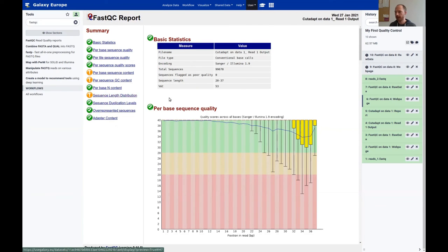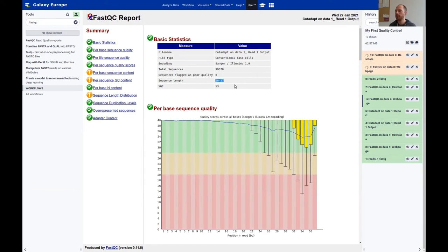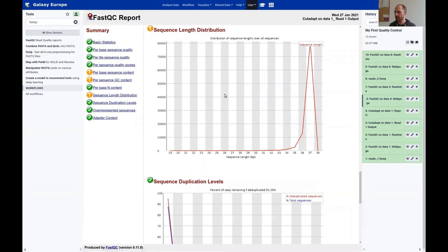Of course, now there's a warning because applying Cutadapt creates reads with different lengths. The basic statistics show length between 20 and 37. Looking at the sequence length distribution, most reads have length 37, with a few shorter ones — these are the quality-trimmed reads. This is also what I'd expect from raw data with different read lengths — most reads at a certain length, with only a few varying.